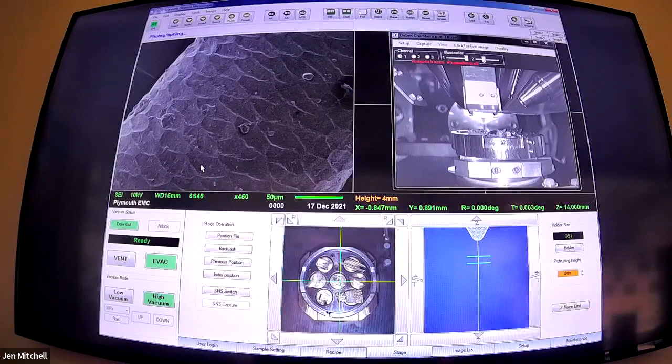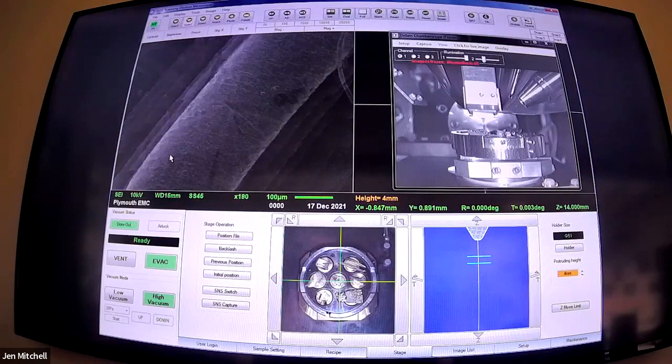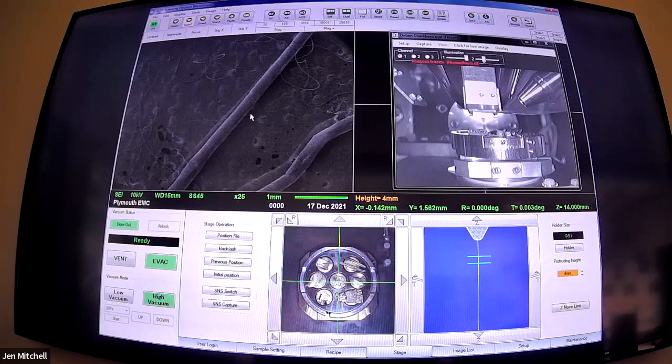It is indeed a reindeer - this is reindeer hair. We got the sample from Dartmoor Zoo a couple of years back. I'm loving the suggestion of Yeti - that would be great. A couple of years ago someone was analysing some Yeti hair and it turned out to be a bear with mange. This is the coarser reindeer hair - kind of like that outer coat. The structure of reindeer and deer hair is quite interesting: on the inside of these big guard hairs, it's actually a sort of open honeycomb structure. I did cut them - I don't know if they're oriented correctly.